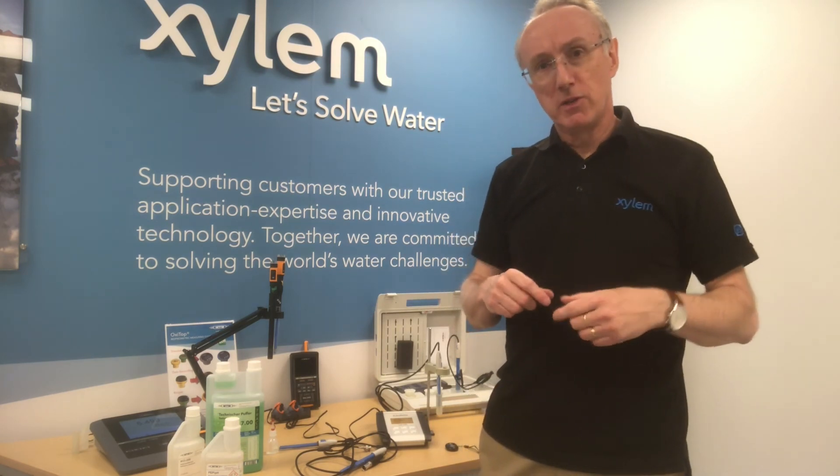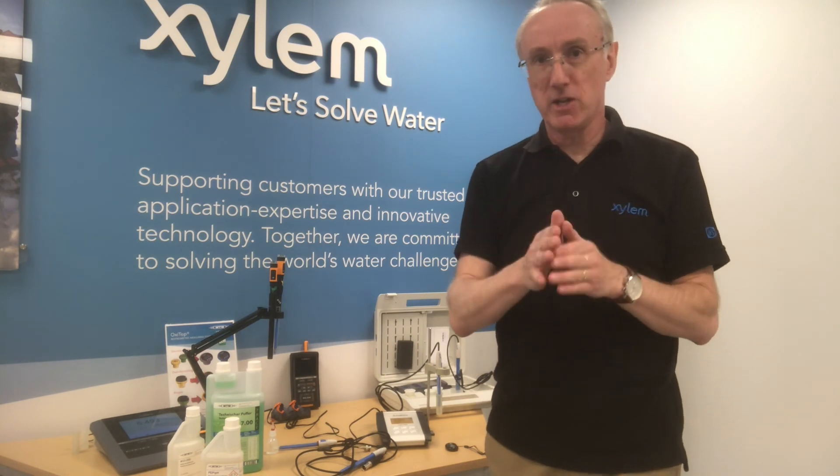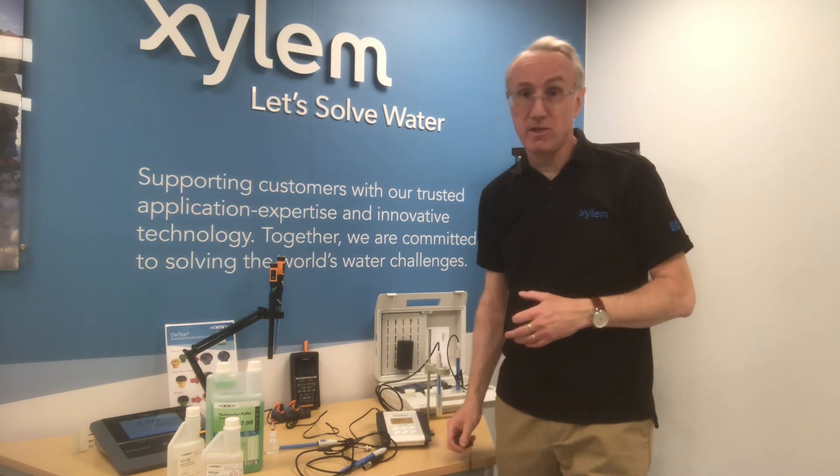I hope that's of help. We'll do more videos going into more depth about calibration. The critical things with a pH electrode are: choose the right probe for the application, make sure you look after it ongoing, keep it topped up, and calibrate it on a very frequent basis. I hope that's helped — thank you.